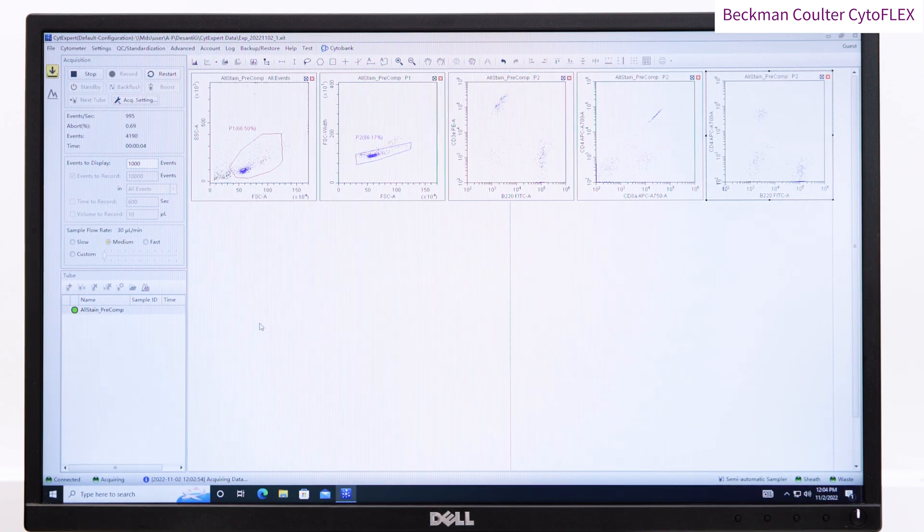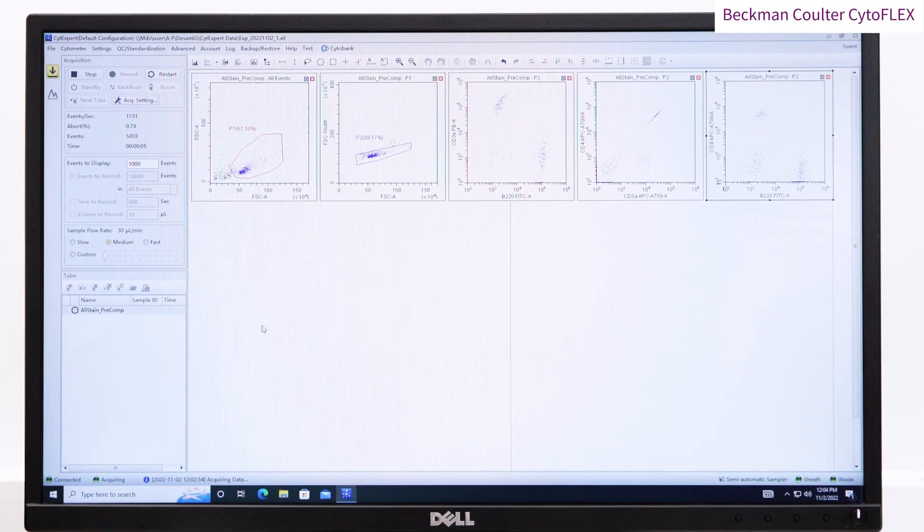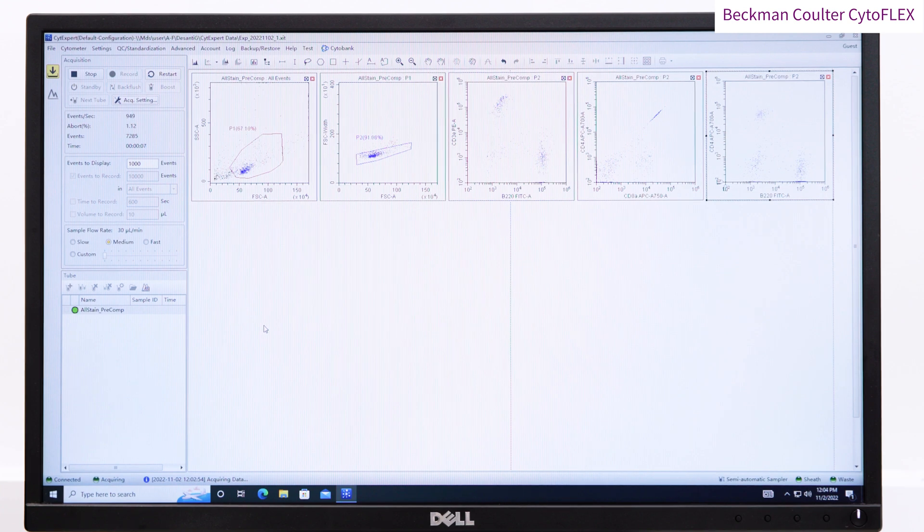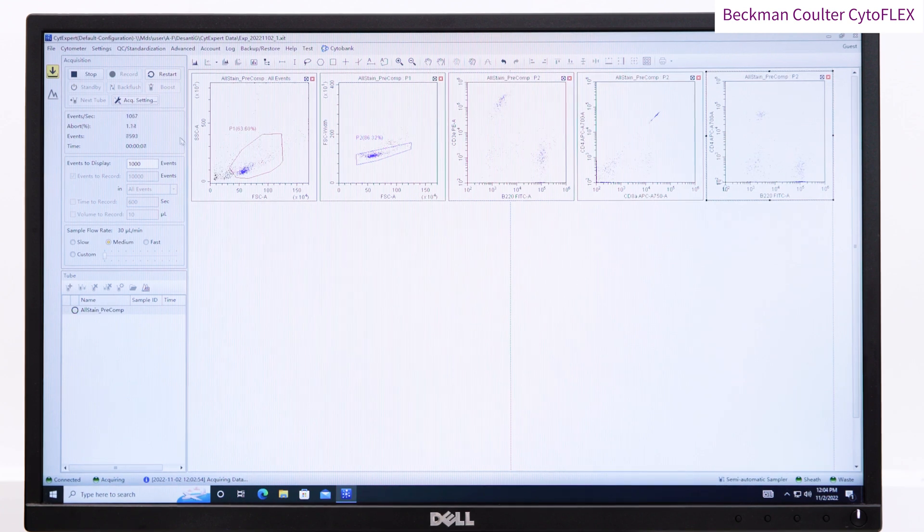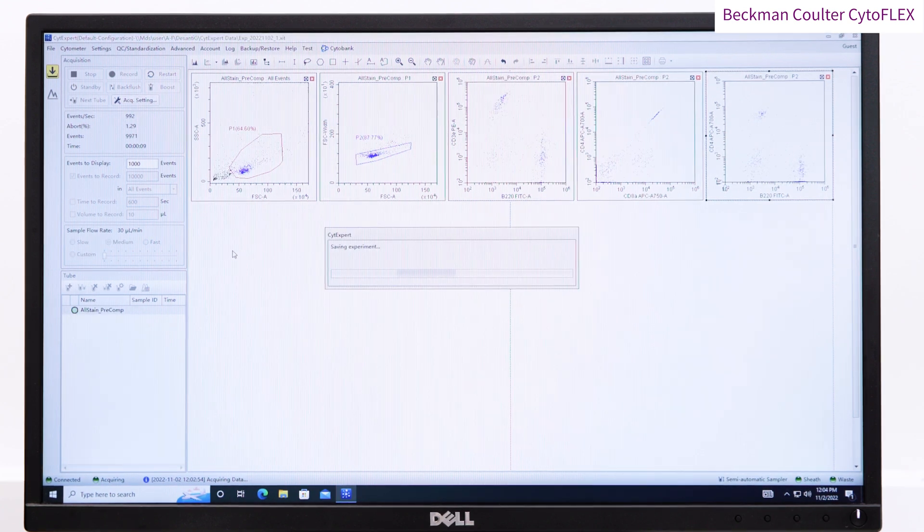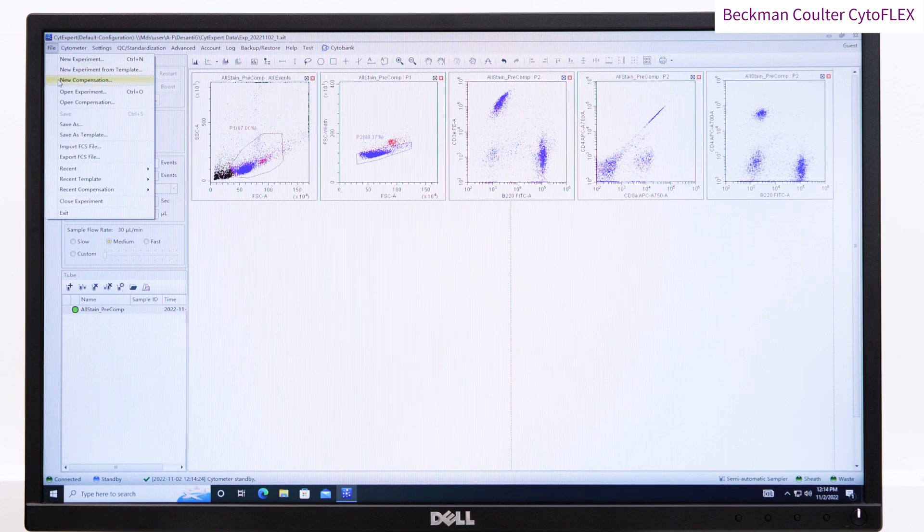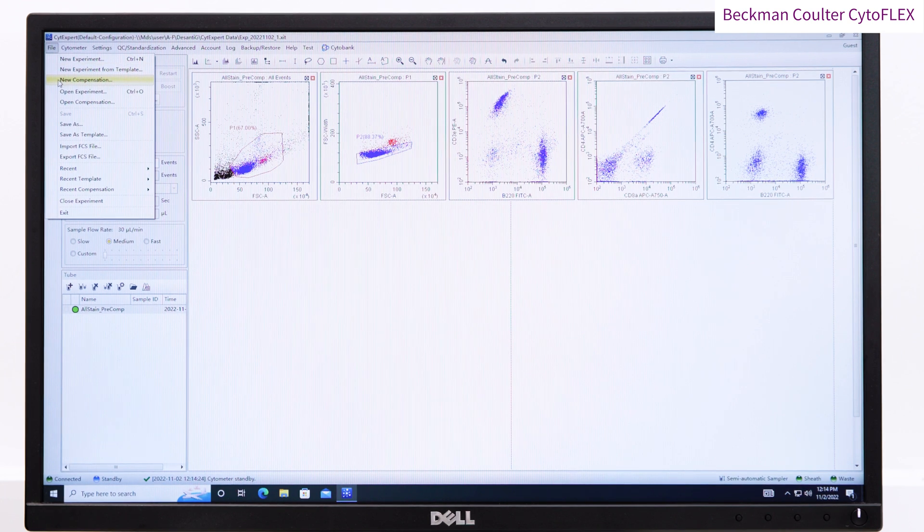If you have a saved compensation, you can apply it here or you can create a new compensation matrix. To do this, save the experiment for later and click File New Compensation.